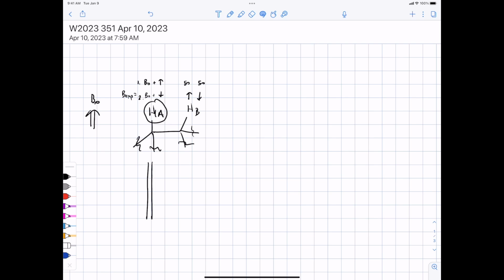We've been talking about NMR, and I wanted to spend just a minute telling you about where the splitting patterns come from. Whatever I tell you, reality's actually more complicated than that, but what I'll tell you is useful enough to help you understand NMR spectra.